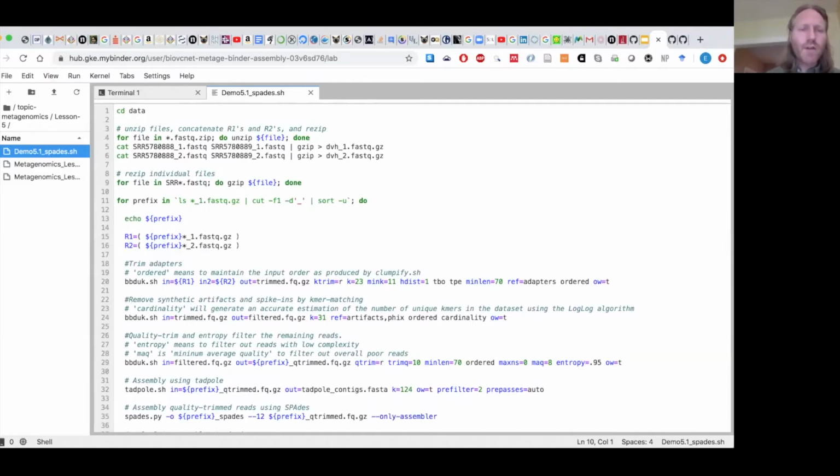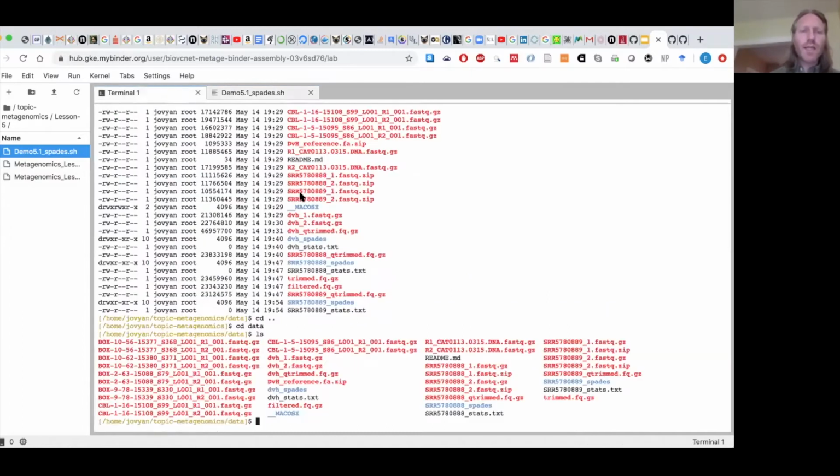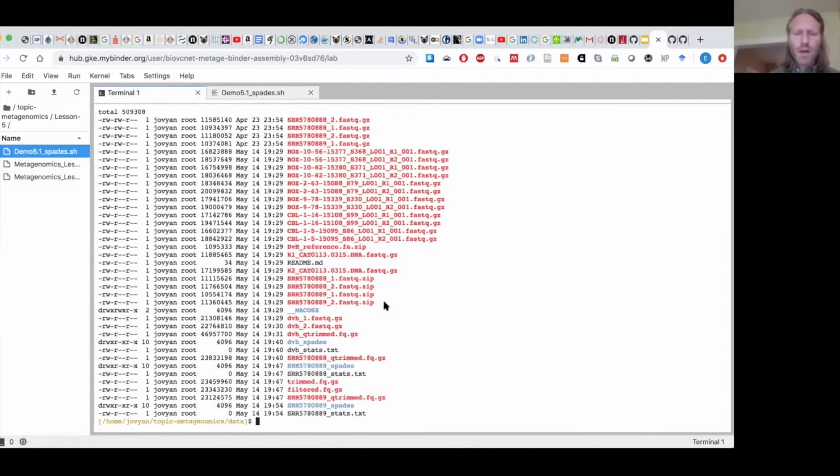the idea here is that we have a number of different sequences of related genomes. In this case, it's a Delta proteobacterium. And we're going to do a number of different assemblies of these sequencing data sets in order to compare the assemblies together. So the output from doing these things will be these two fastq.gz files, dvh.1 and _2, which are going to be the reference, and then these, which are downloaded from the sequence read archive, which will be used as comparisons.